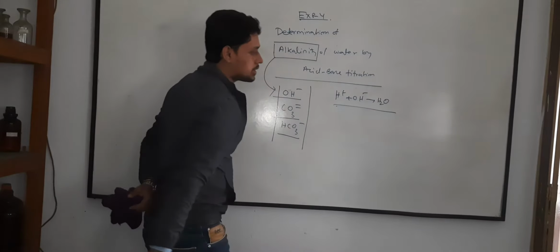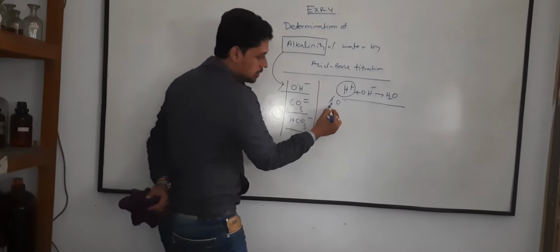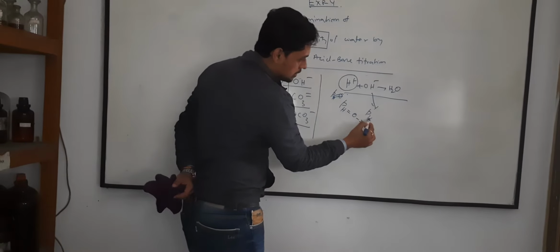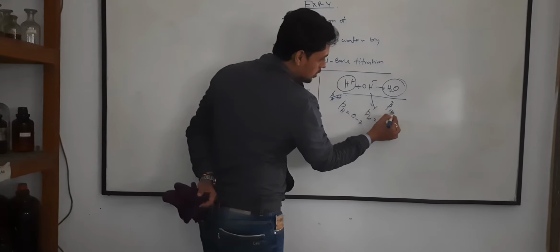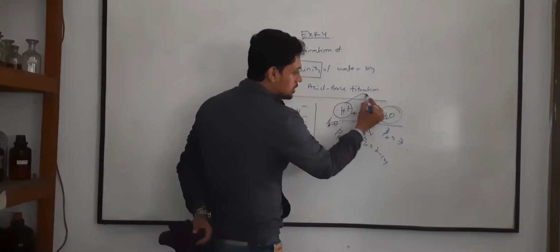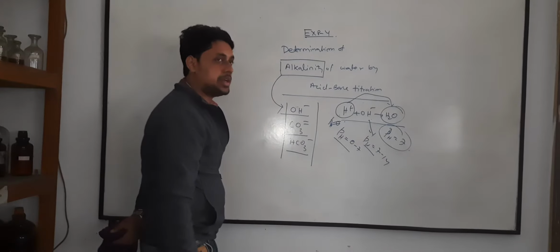It was a neutralization reaction. I have already told you in experiment 3 that acid means pH 0 to 7, base means pH 7 to 14, and neutral means pH equals 7. So when acid and base react together to form water, the process is known as neutralization. There will be no acid, no base, but it will give us the neutral pH, which is pH 7.